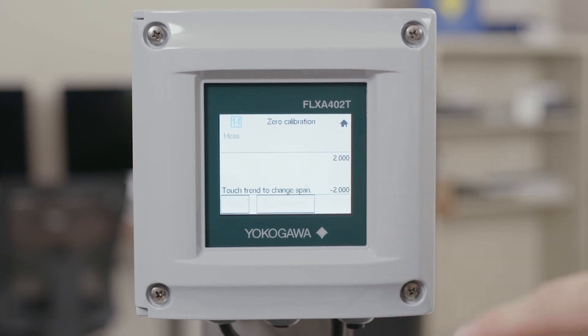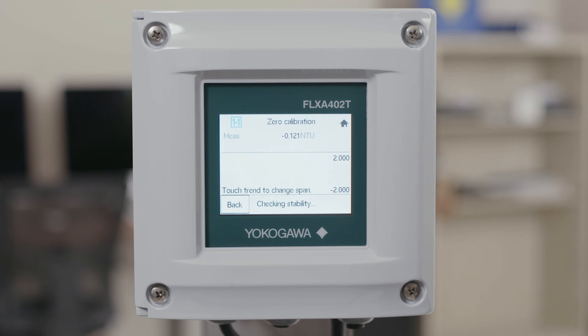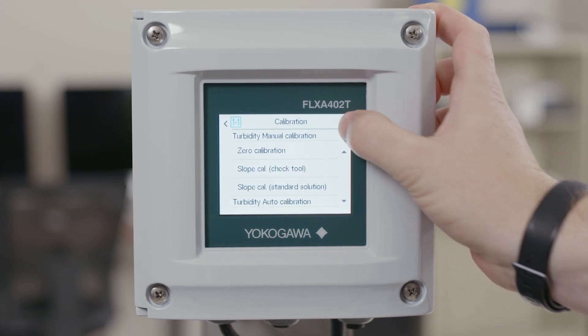The calibration screen will come up and will show the measured value as well as a trend line, a back button, and a check stability button. Give your measurement a little bit of time to stabilize and stop changing. Once it has, go ahead and press check stability. This will allow the analyzer to watch the value and once it sees that it's stable it will show as next. This next step will then calculate the zero point on the calibration line and show you your new measured value. If you agree with this measured value and the slope line, you must hit accept to finish the calibration. Now your calibration is stored and you have a zero calibration.